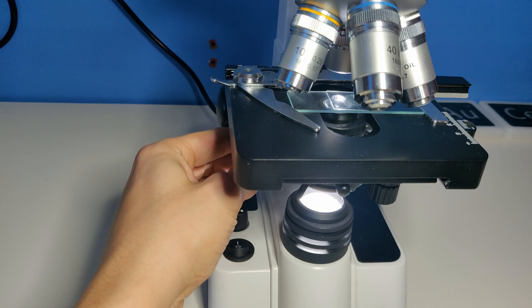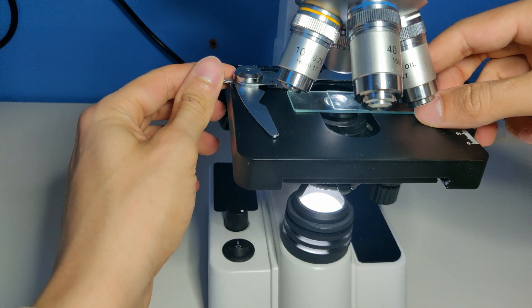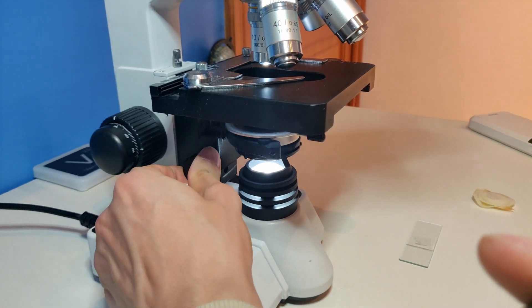Adjust the height of the condenser so that there is only a few millimeters between the specimen and the top of the condenser. When you see through the microscope you normally see a polygon — in this case a hexagon. But the edges of the hexagon may be blurry. Turn the condenser down until the edge of the hexagonal image is sharp.